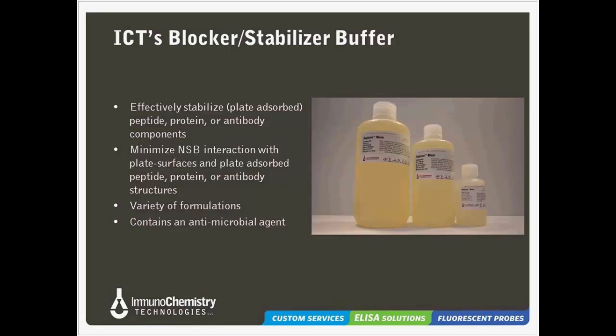In addition, sometimes you have conjugates that you didn't make very well, and those conjugates themselves are sticky, and you want to minimize the sticky conjugate from nonspecifically binding to the blocked plate well surface. So in both cases, you have something binding to the blocked plate well surface, whether it be something from your sample matrix, or maybe it's your sticky conjugate, and these things do happen. How do I still use that conjugate without having to go back and redo it again?